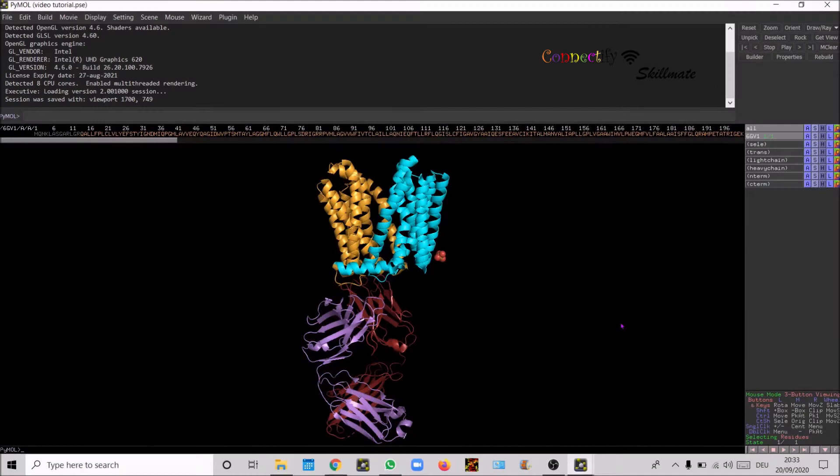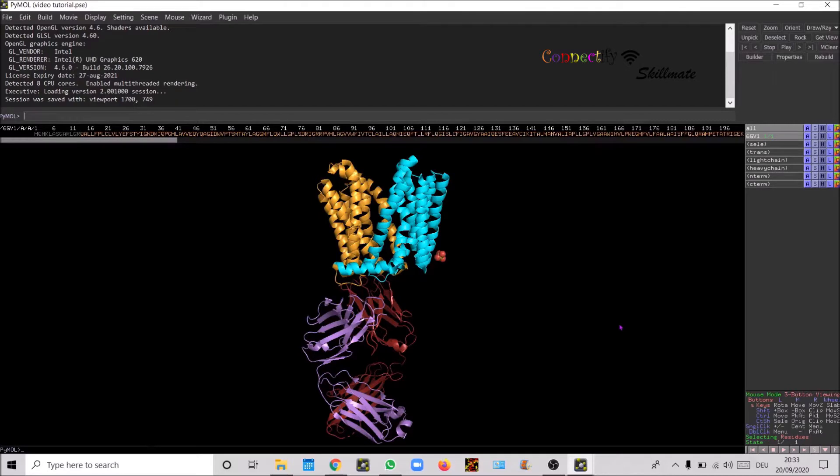Welcome back to my tutorial on PyMOL. Last video we saw how to define selection of molecules. Today we will see how to create a nice crystal packing figure. This is a transporter bound to a fab region of an antibody.